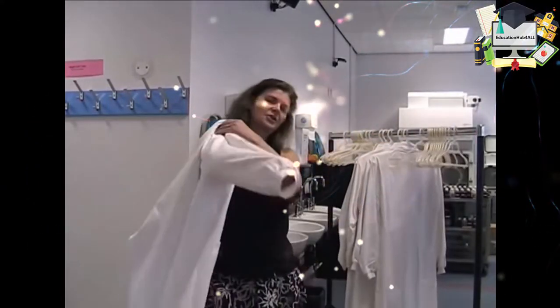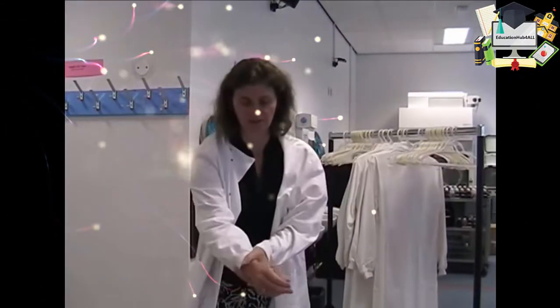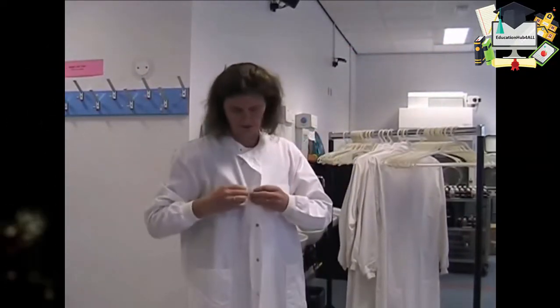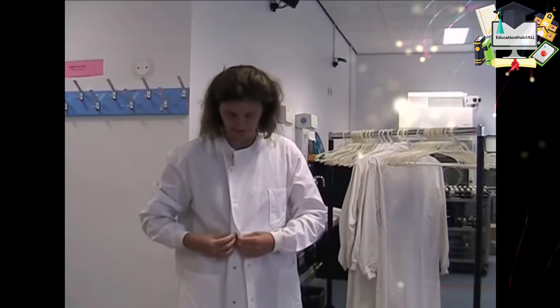Okay, the first thing you have to do when working safely in the microbiology lab is to wear a lab coat. In microbiology labs, the lab coats are special coats. They have elastic around the arms so that nothing goes up your arms, and they tie right up to your neck, and you should tie the front of the lab coat so that it's completely tied.